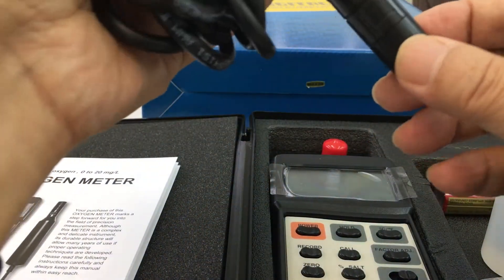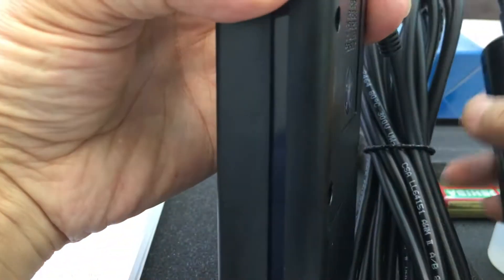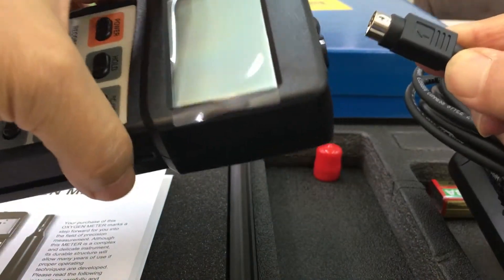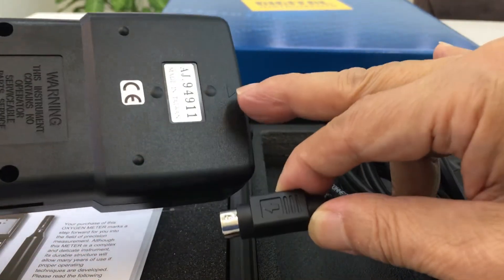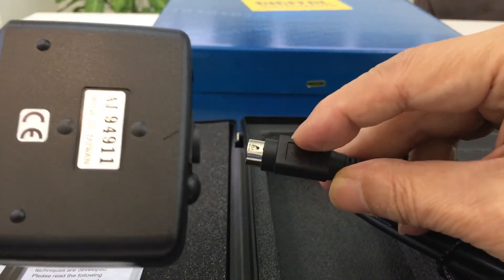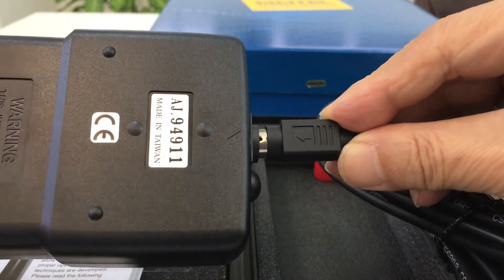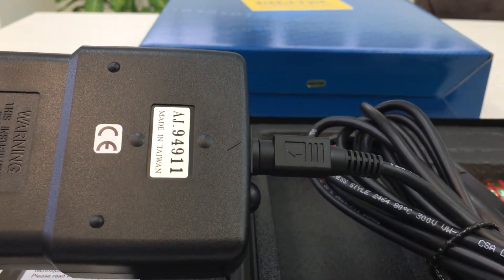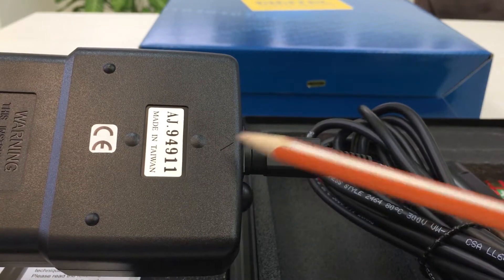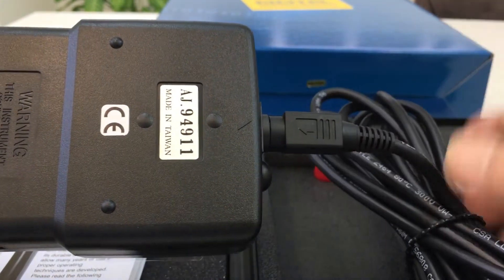Once the liquid is inside, be careful to connect this cable correctly. There is a direction arrow here — be careful of the direction. Put it in directly. Follow the arrow direction to avoid damaging the meter's hole.